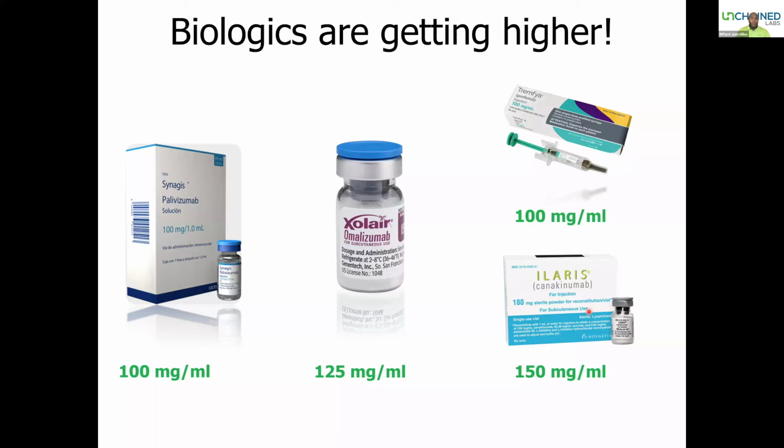So for instance, one of our customers came to us and said, look, we're developing this therapeutic that has to be delivered in the eye. And as you can imagine, if you start putting a lot of liquid in the eye, you're going to increase the pressure, and that's going to cause other effects, right? So they're limited in the amount of volume that they can actually deliver, and therefore they have to concentrate their therapeutic as high as they can in order for them to have an impact. And so you are very much limited by how much you can put in. So you want to essentially overload the concentration in order to have the impact that you want. And for doing so, you want to also be able to characterize them at that concentration, right? So it's going to be what your patient essentially encounters.